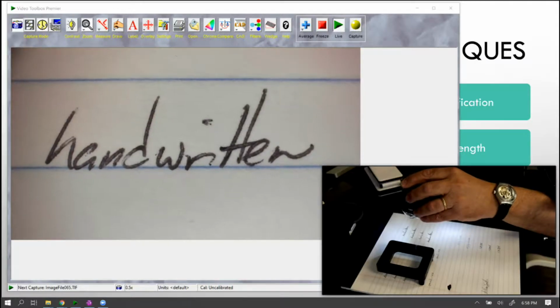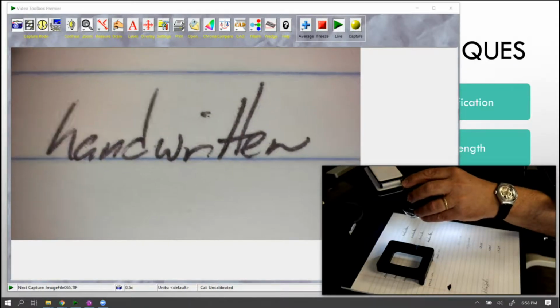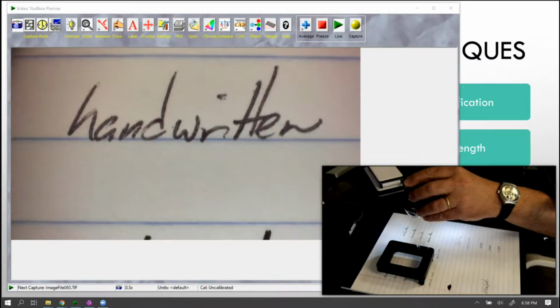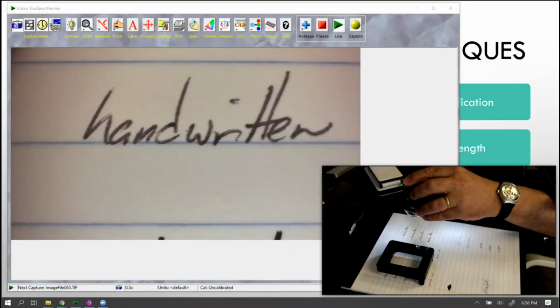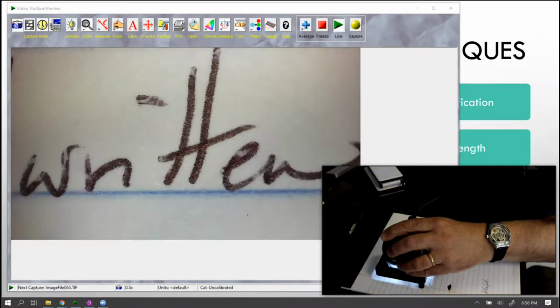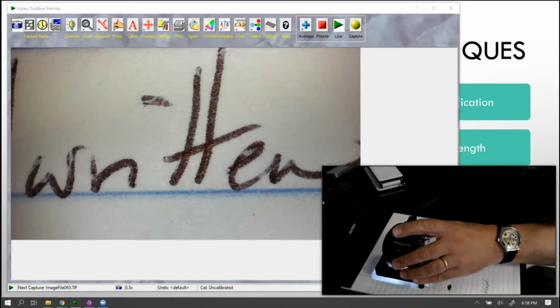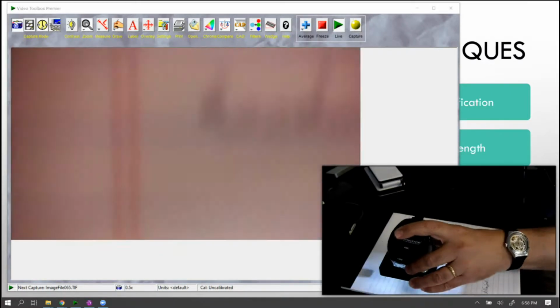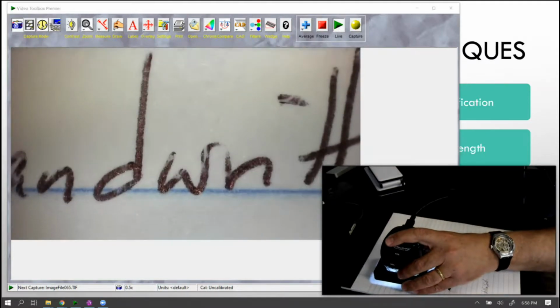This is the typical configuration for something like this, where we can get about 2 to 2.5 inches while operating further away, or as we get closer with the MiScope, what we'll see is our magnification increases. And here what we have are some different ink samples.